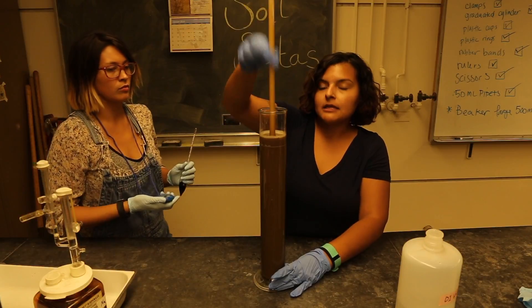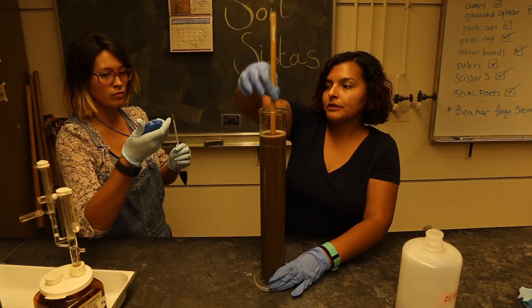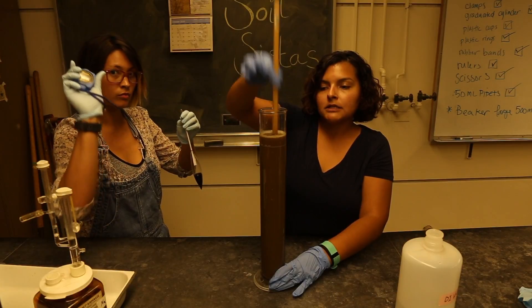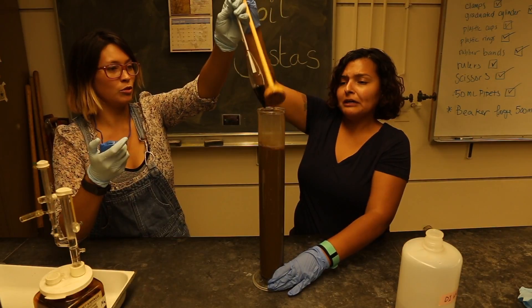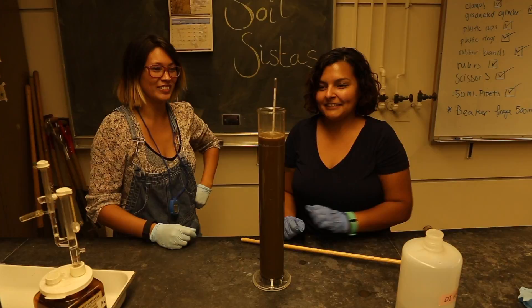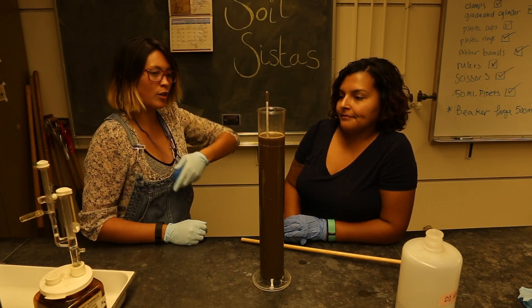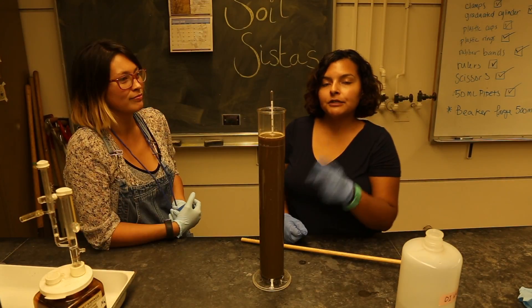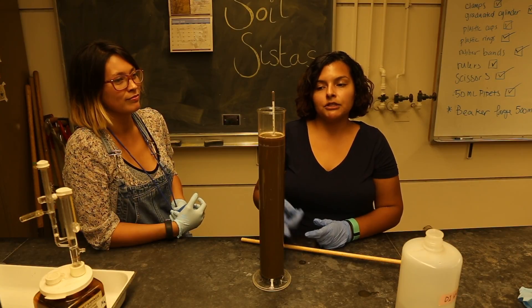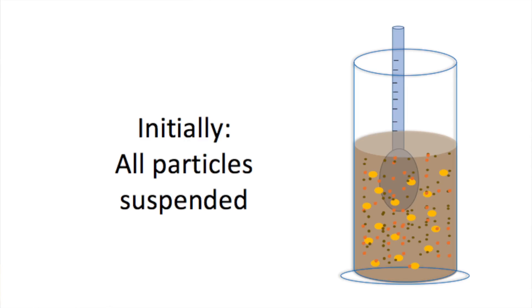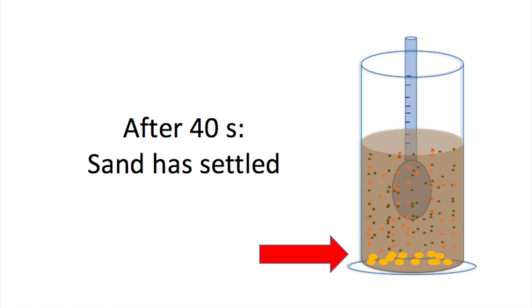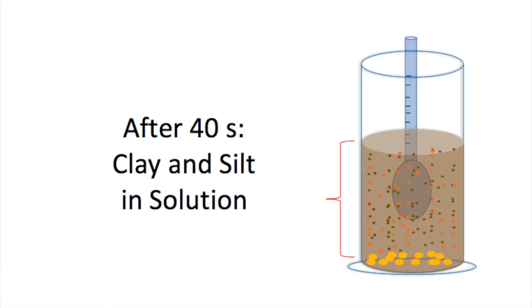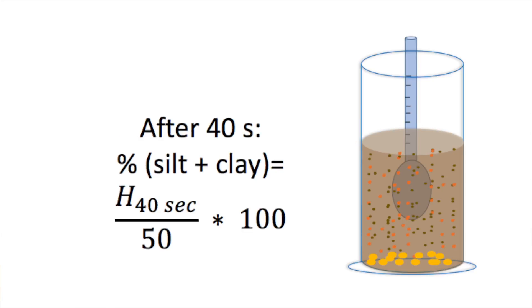Now we're going to use a plunger to re-suspend everything in the sedimentation jar, and then as soon as I take this out, Amy is going to set in the hydrometer and time for 40 seconds. That's our reading — this reading gives us the percent of silt and clay in solution, because after 40 seconds the sand has settled out and only the suspended clay and silt particles are pushing up on the hydrometer. We'll use this reading in our future calculations.